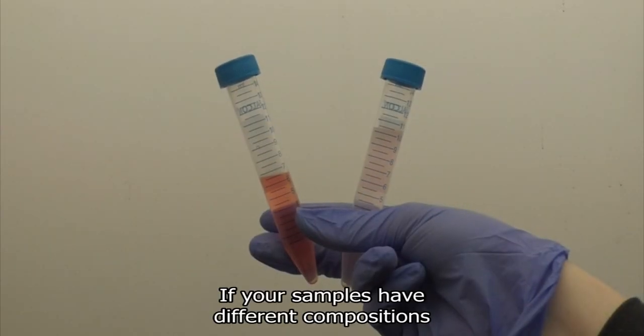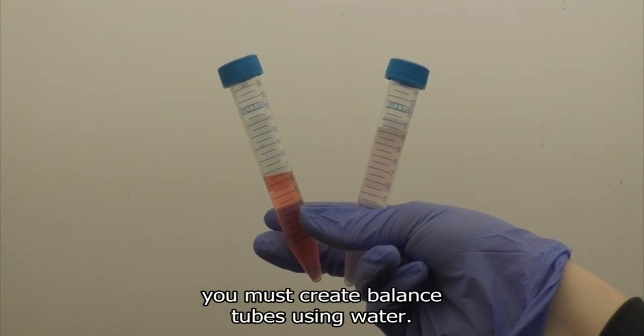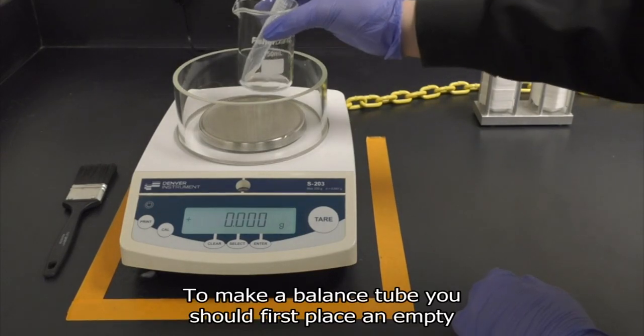If your samples have different compositions and cannot be split evenly between two tubes, you must create balance tubes using water.